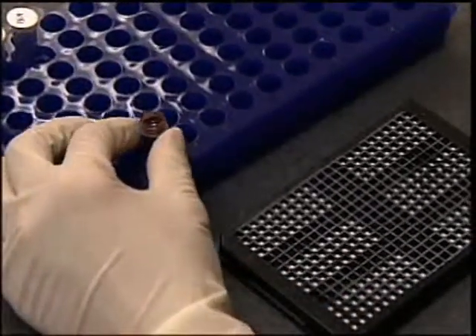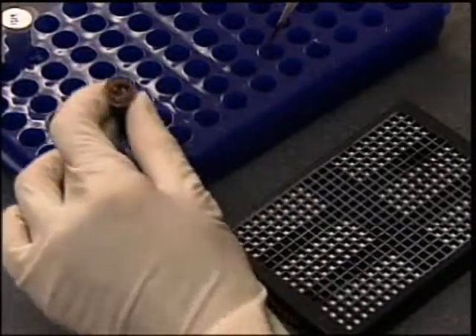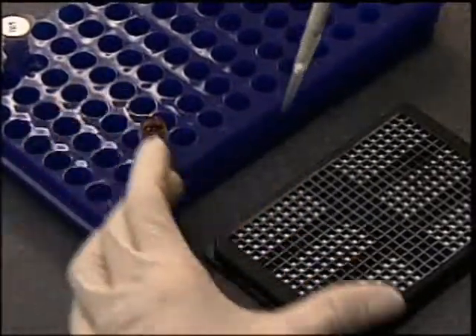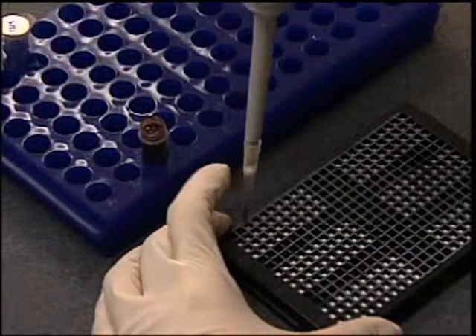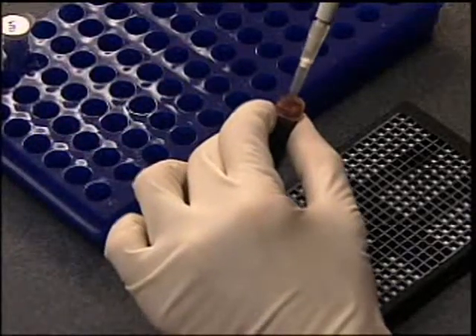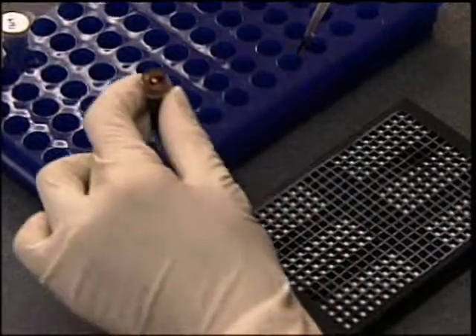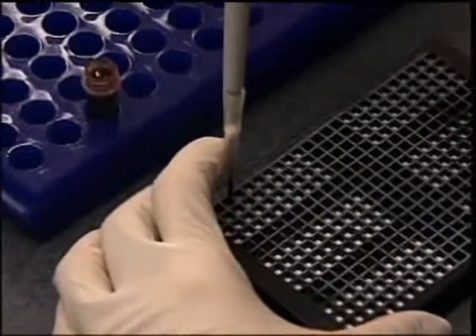Using a pipette, aspirate 10 microliters of your blood sample. Position the pipette straight into the well of the GenPlate and dispense the sample, being careful to dispense only onto the paper and not onto the plate walls. We have found that positioning the pipette straight onto the well achieves better performance than angling the pipette.